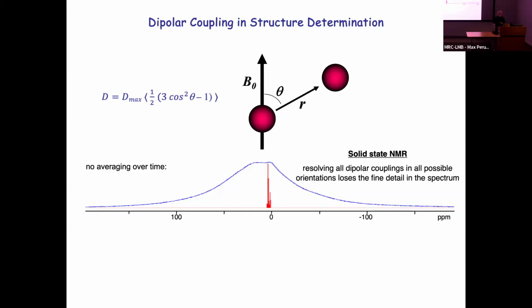We don't do any solid state NMR in-house in LMB. If we have any projects that need that, we collaborate with people outside. And the reason is it's a really very different technique, and it's dominated by the need to suppress these dipolar coupling terms.